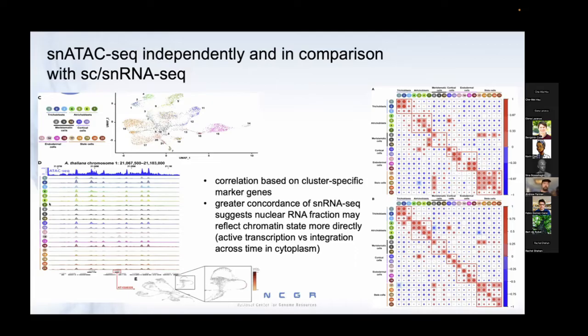We were able to show that our ATAC-seq data largely was similar to the overall picture that bulk ATAC-seq presented. But in addition, you could tease apart, as you would expect, cluster-specific peaks that seem to be related to gene-specific activities in some of these clusters.